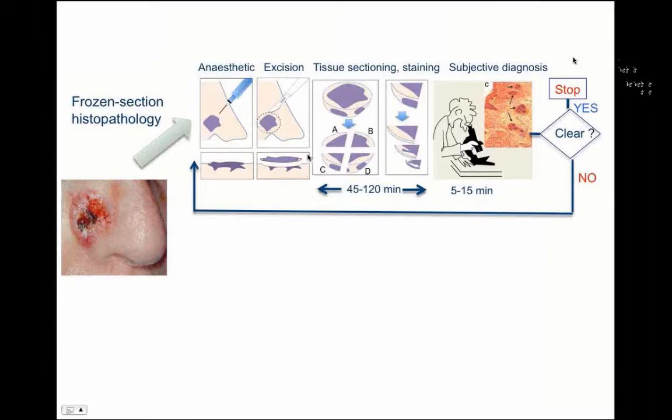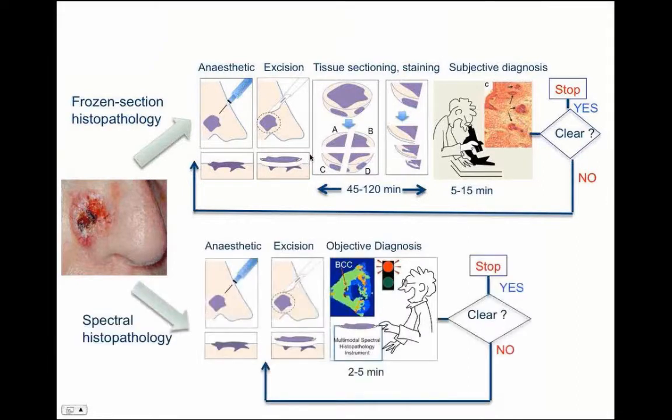Typically, most of the patients are cured with 1 or 2 layers. In more difficult cases, for large tumors, patients can go up to about 4 layers. So what we tried to do is replace this process with an automated technique, like a Raman spectrometer, or an instrument based on Raman spectroscopy, where the tissue layer can be placed directly with no sectioning, no fixation, and within a few minutes, maybe 10 minutes maximum, obtain information like an image which will be able to tell whether the resection margins are clear of tumor cells or not. Then the surgeon could immediately act on this information and remove any tissue layer if needed.